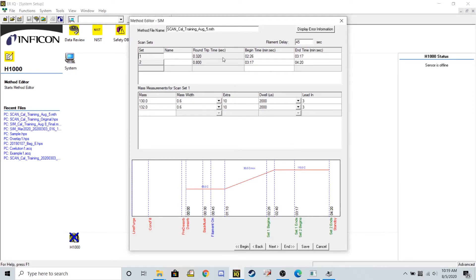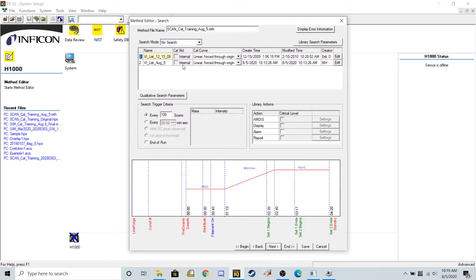Now that I've specified the windows and the ions that the mass spec needs to look for for my two chemicals of interest, I can go over here and click next.